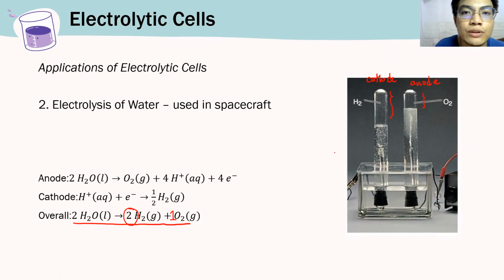And this is what we're going to replicate in the experiment. Okay, we will try our best using our home materials to recreate electrolysis of water, and that will allow us to solve for the Faraday's constant experimentally.